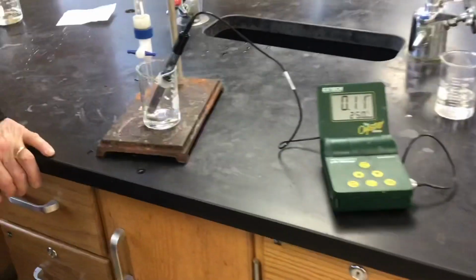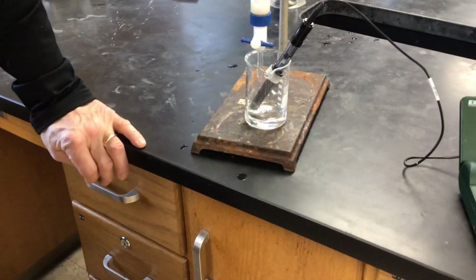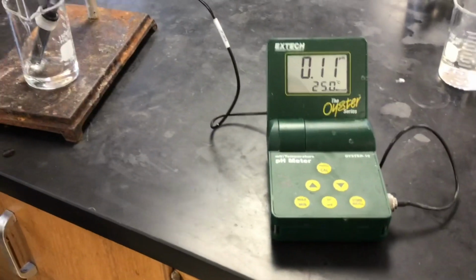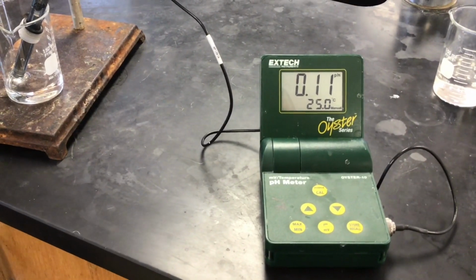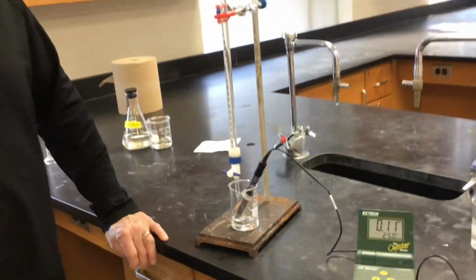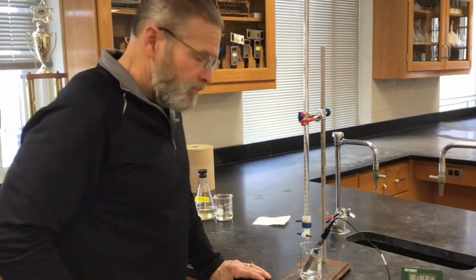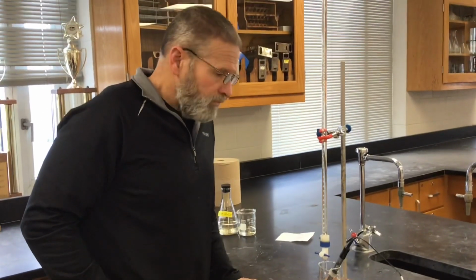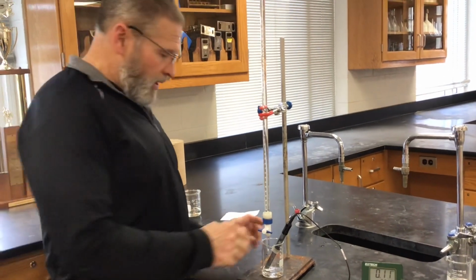So this is the sample 2. Strong acid. And before we add any of the sodium hydroxide to it, this is the pH. And now, using the burette, we're going to go by 1 ml at a time until we feel like we're close to the equivalence point. Then maybe we'll slow down a little bit. Okay, are you ready? Here we go.